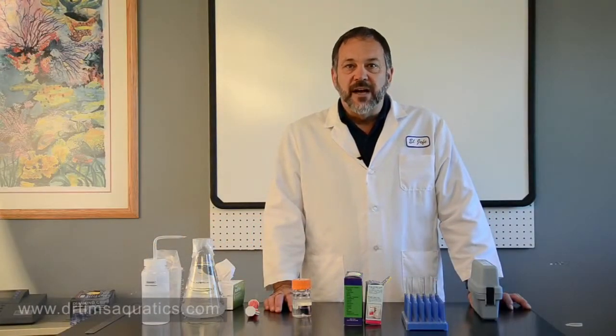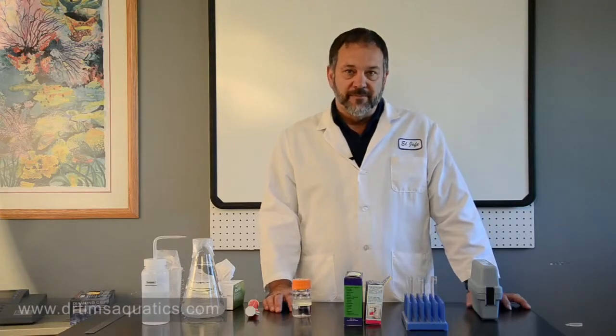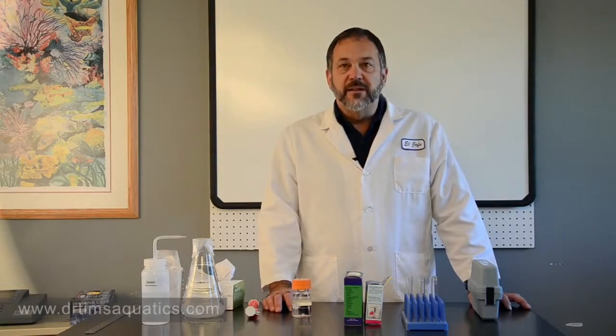Hi, I'm Dr. Tim, founder of Dr. Tim's Aquatics. I'm going to talk about test kits today — how to use them, and two common problems with test kits.